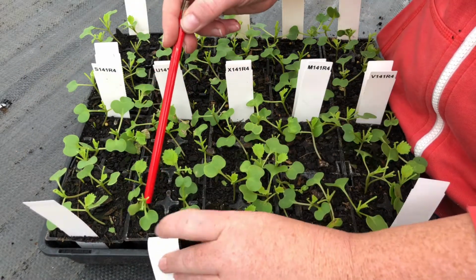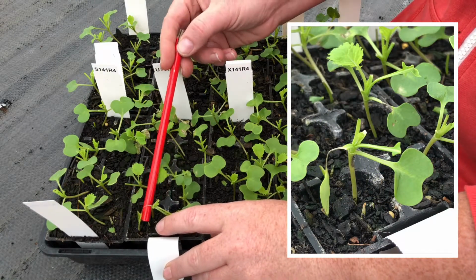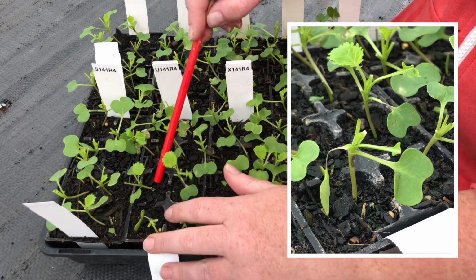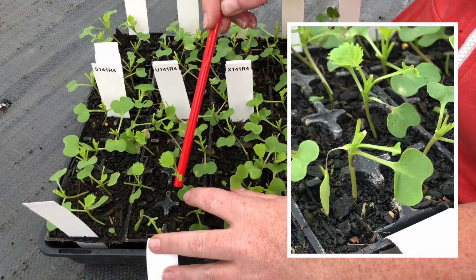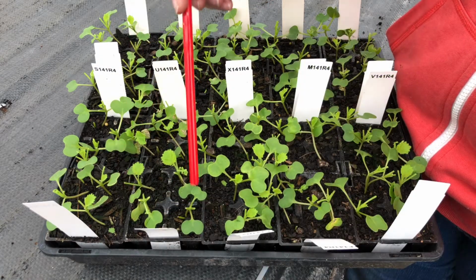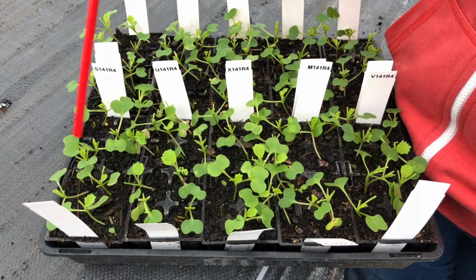Here again, another DMI. This is our Jockey, so our fluquinconazole. You can see that the petiole here is completely collapsed. This plant, actually the hypocotyl right down the bottom there, is also colonised. And here again the petiole. So you can see there's quite a big difference between this resistant population here and not having any resistance to the SDHIs.